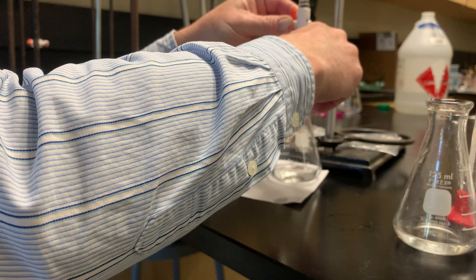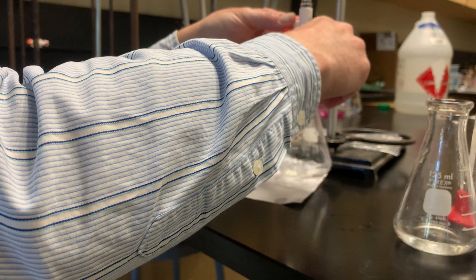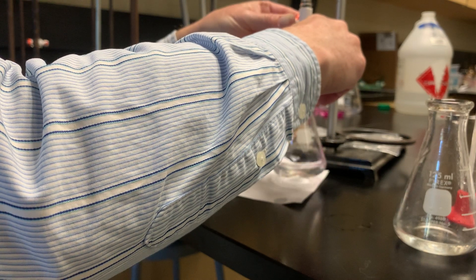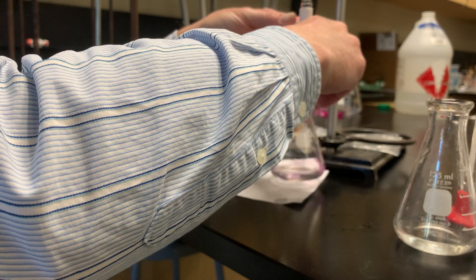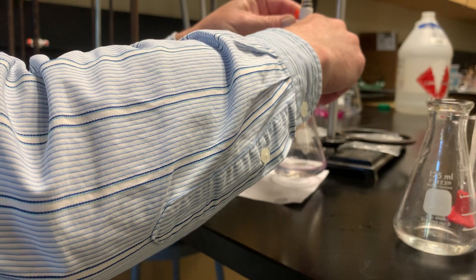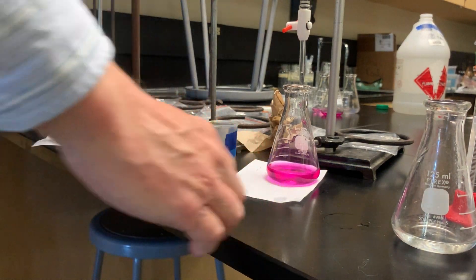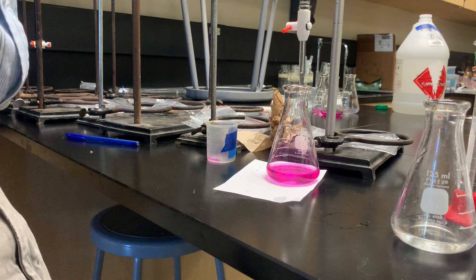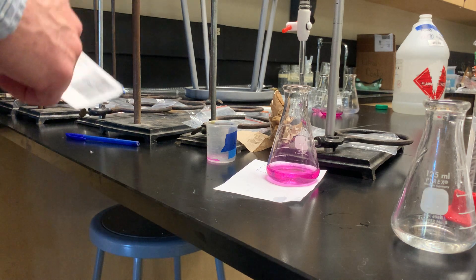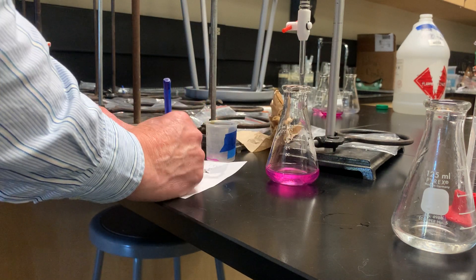So close — just one more drop. This was essentially a competition during class, trying to get the lightest possible pink color, which made it fun. Now we read our final volume. The final volume is 8.20 milliliters. Okay, now we move on to trial two.